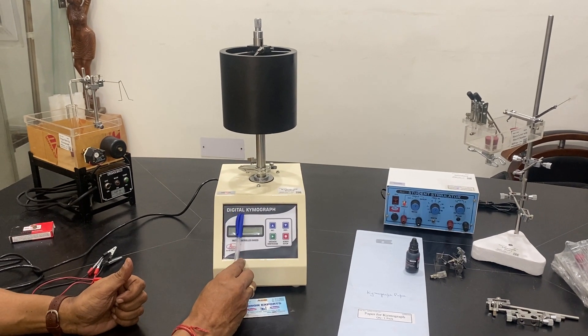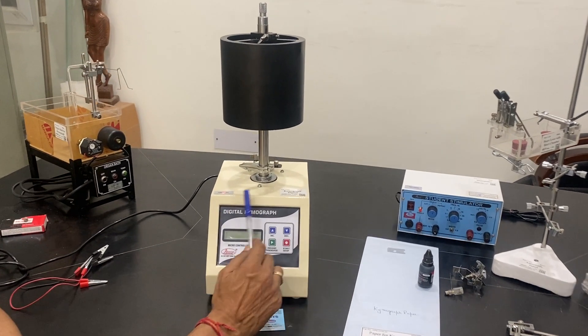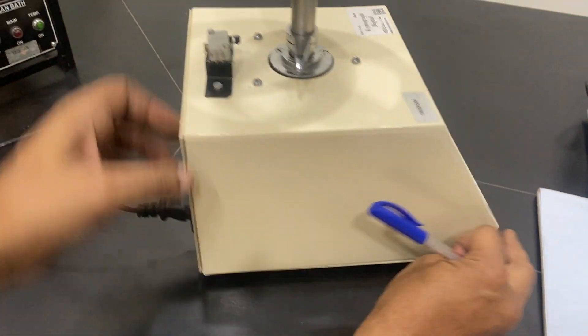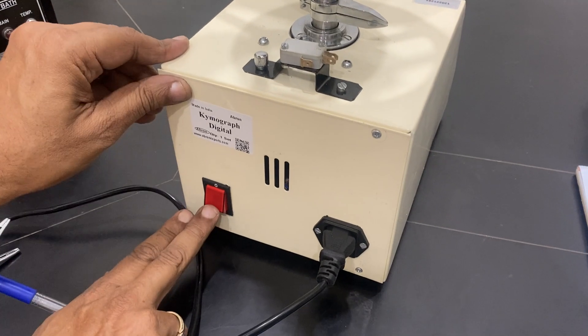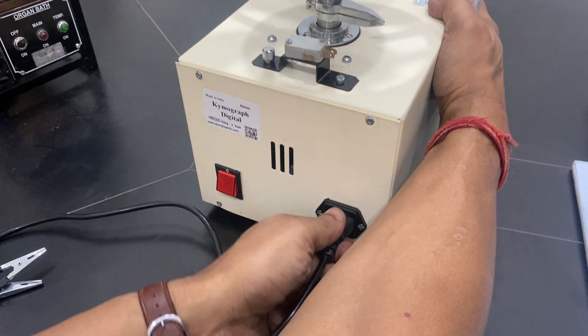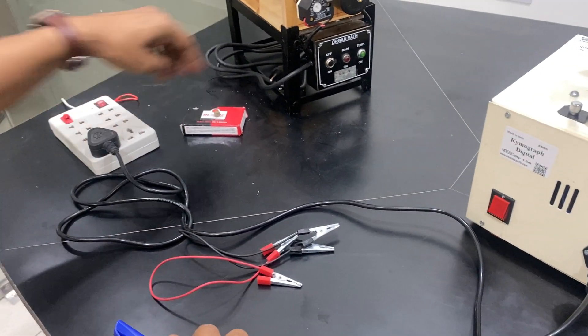This is Abron digital kymograph. Now let us learn what are the parts of it. We have on the back a power switch and the computer attachment unit. This particular model has two types of wires with us.